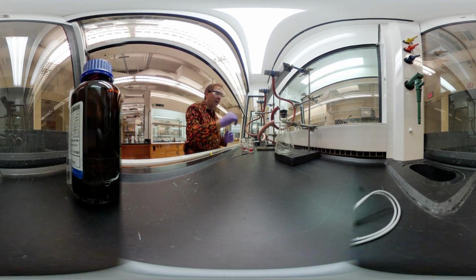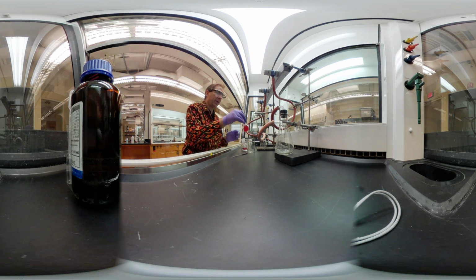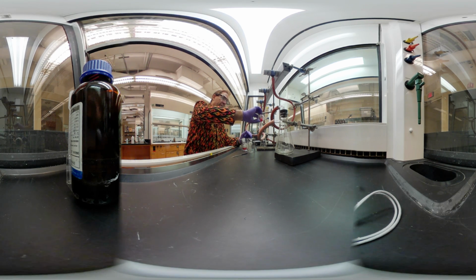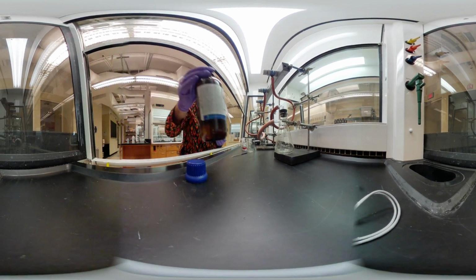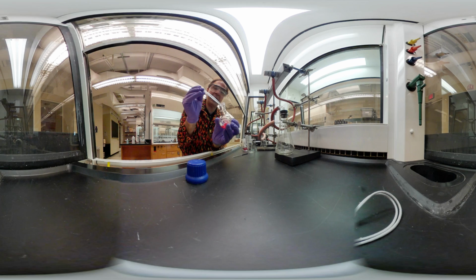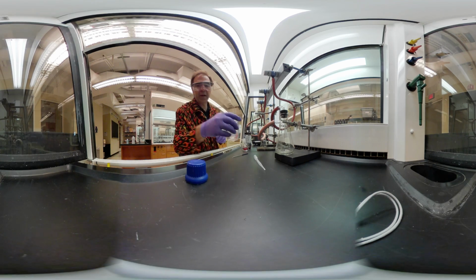Go ahead and turn this on. And I'm going to filter both of these, and we're going to try to collect the liquid out the bottom there. So hopefully this will work. Okay, so I'll get the vacuum on. There we go. Now we're going to use an extra 5 milliliters of the methylene chloride solvent to rinse out more of our red material. You see, as I do it, the salt kind of loses some of its color because we're getting that red material there. So let's go ahead and put that across the filter. All right. Let that go just for a minute while I do the other one.